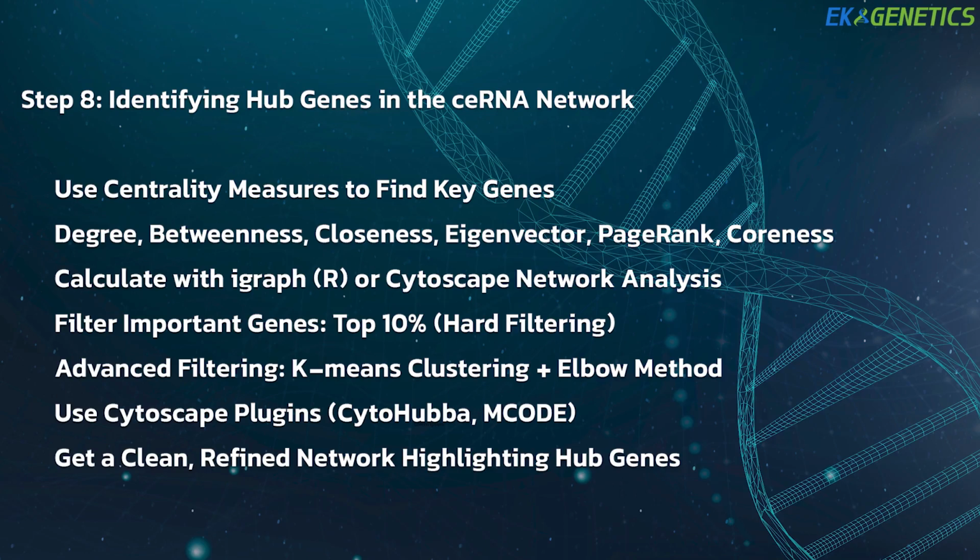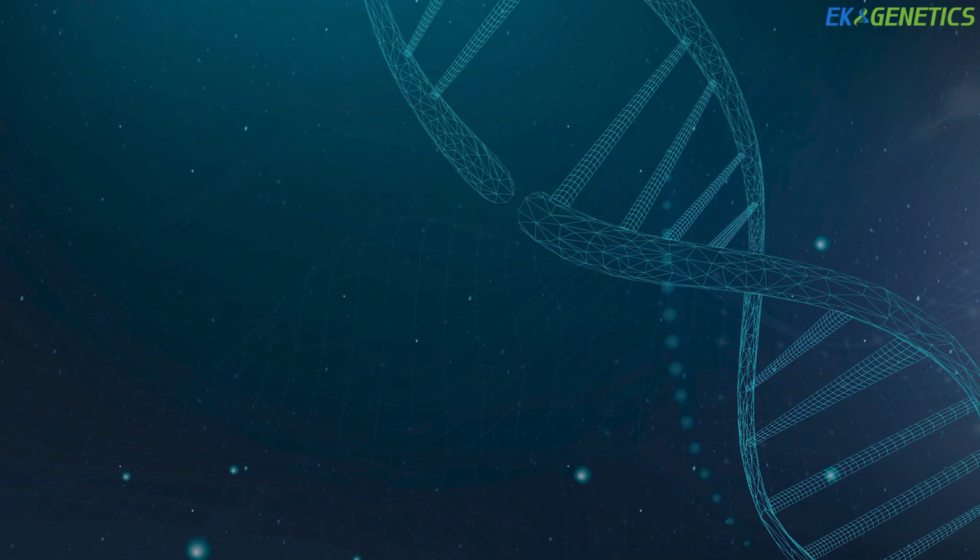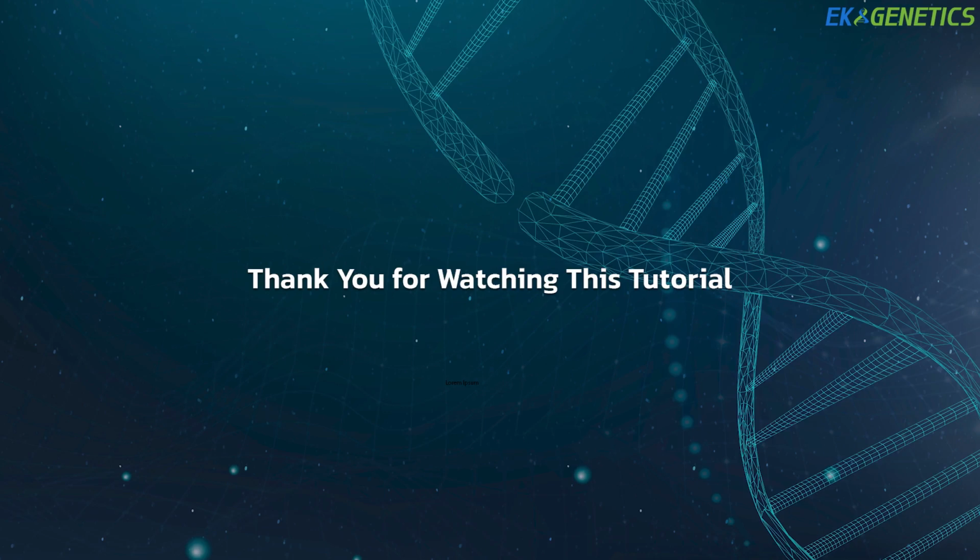After this step, you'll have a much cleaner and more interpretable ceRNA network focused only on key hub genes, which makes visualization easier and biologically more meaningful. And that's it. Now you know exactly how to build a ceRNA network step by step, from raw data to identifying the most important hub genes.